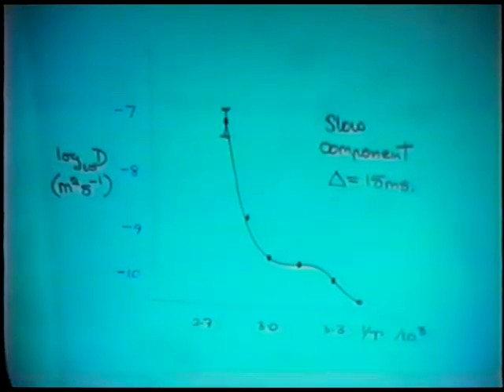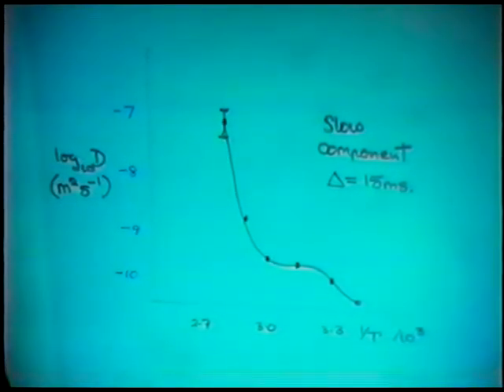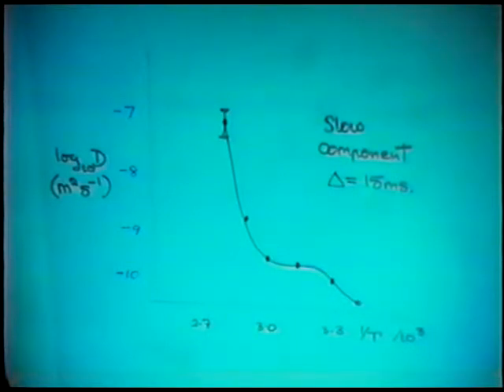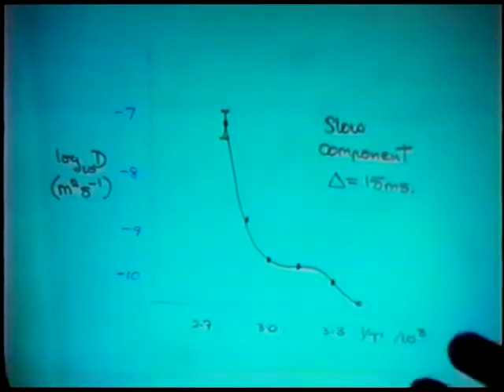It turns over, and I think this is seeing some sort of restricted diffusion. We're now seeing the barriers, the constraints of the size of the crystal, and then if you give it a bit more energy, they can get out and we see diffusion into the gas phase. So this is a rather naive explanation, but it's just how we see the data at the moment. I should say that the group at Leipzig have done a lot of work on diffusion in zeolites and have seen similar behaviour in zeolite A and other materials.